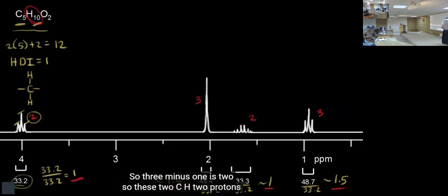Yes, it can be like this, or CH3, because of the two oxygen atoms. So we've been able to talk about three proton singlets.